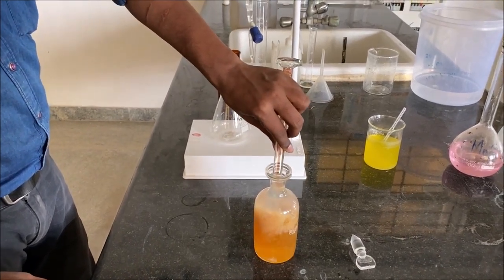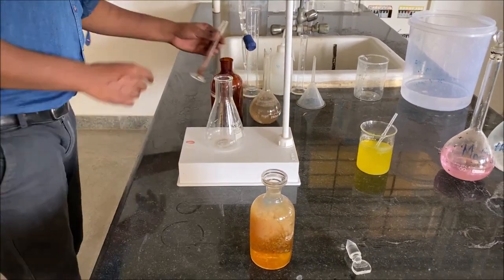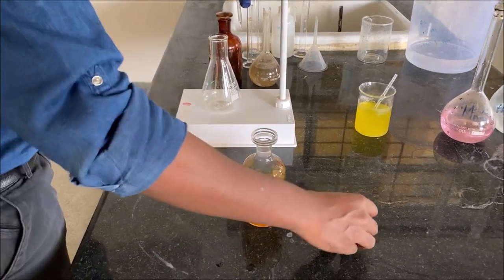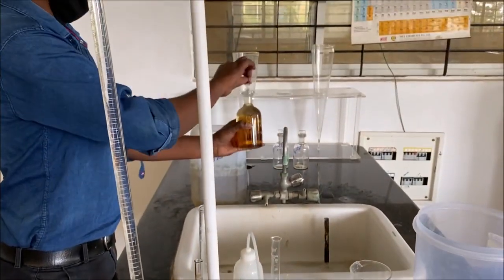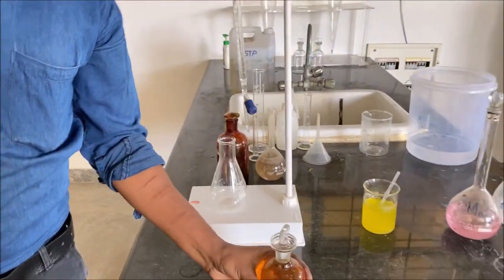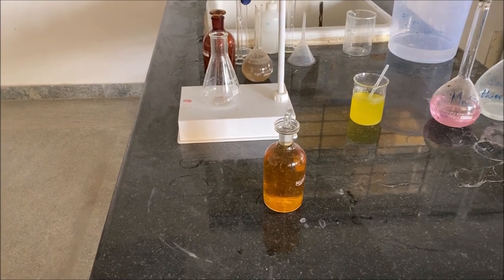As soon as we add the concentrated sulfuric acid, the whole solution turns yellow. The lid of the BOD bottle is closed and shaken well to make sure the solution doesn't contain any air bubbles. So then our solution is ready for titration.